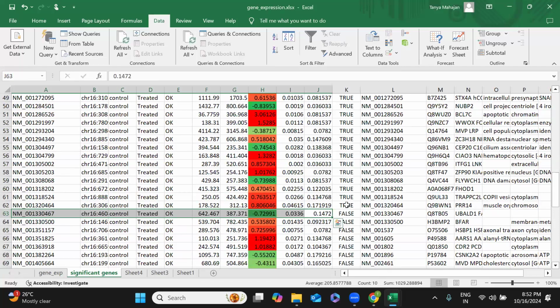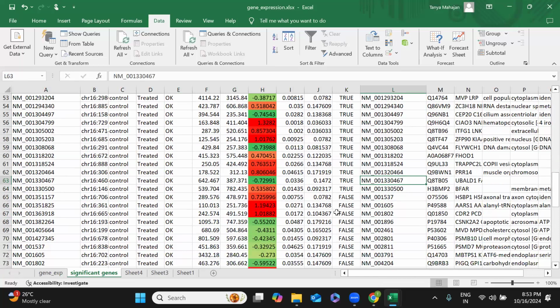Now from here, true entry, just autofill your data again. Now next again, you're getting false. Why? Because the IDs are not matching again.